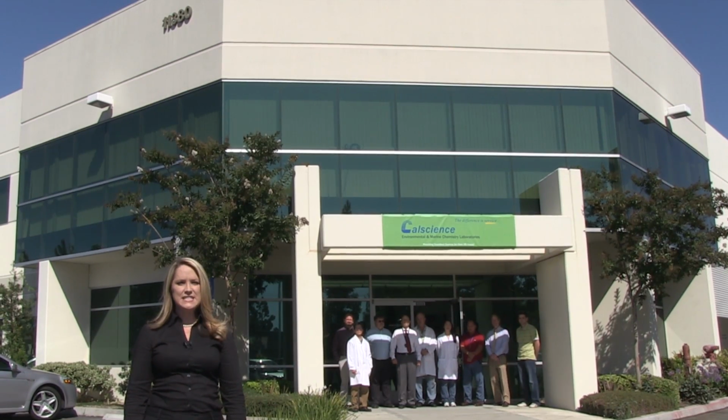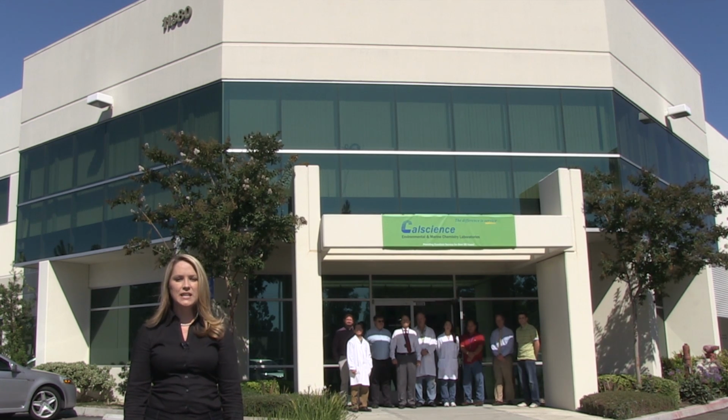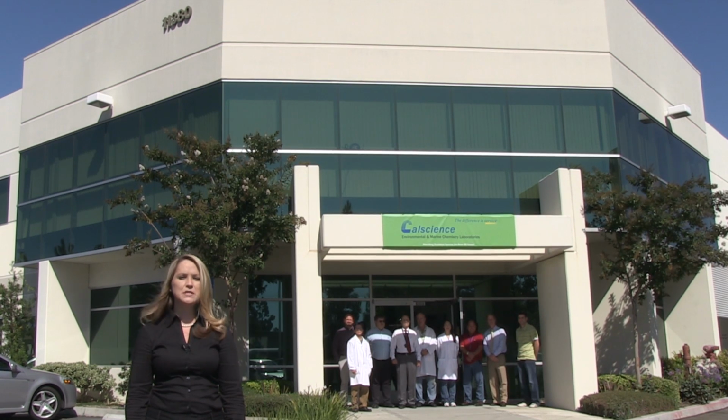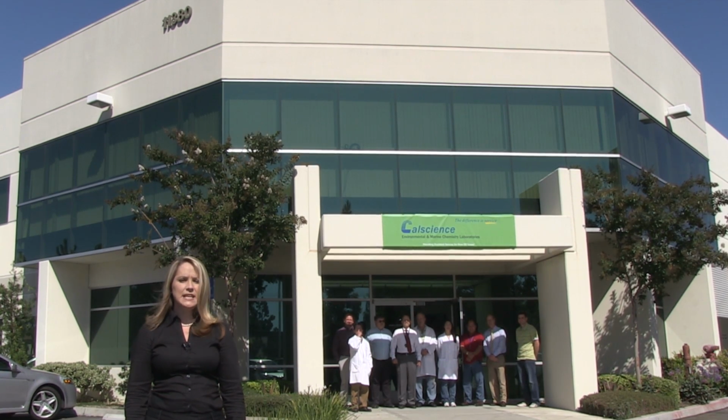We've arrived at our final destination, the Marine Chemistry Laboratory on Knott Street. This building offers 9,000 square feet of laboratory and office space. The laboratory is dedicated to marine chemistry testing, including sediments and tissues.